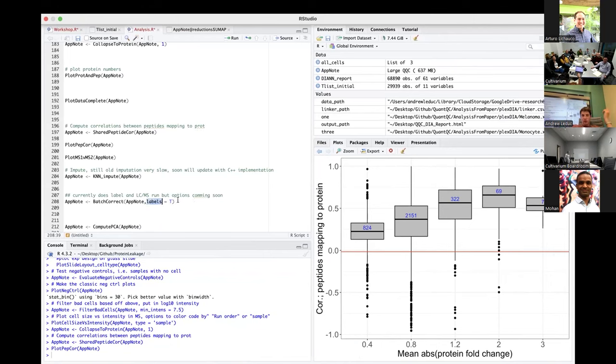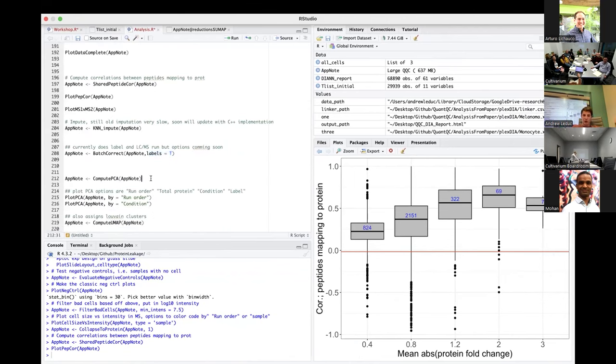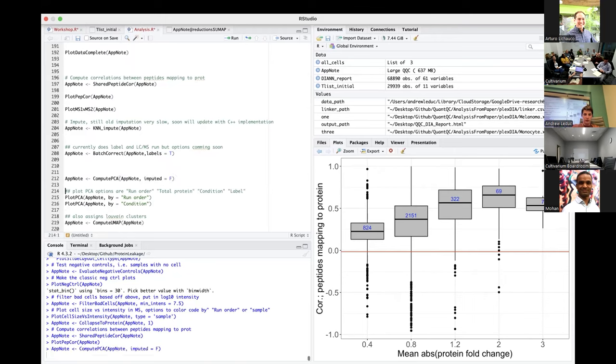And for the labels, you can see if you need to do this or not based on the quality plots. If you can see the separation on the PCA, chances are you might want to add it. There can be some small biases that are really easy to correct out with the most simple algorithms. It's only three covariates and you have a lot of data. So we can compute the PCA, I think. Yeah, the option for imputing equals false. A lot of the documentation should be on the GitHub, but probably needs to be improved.